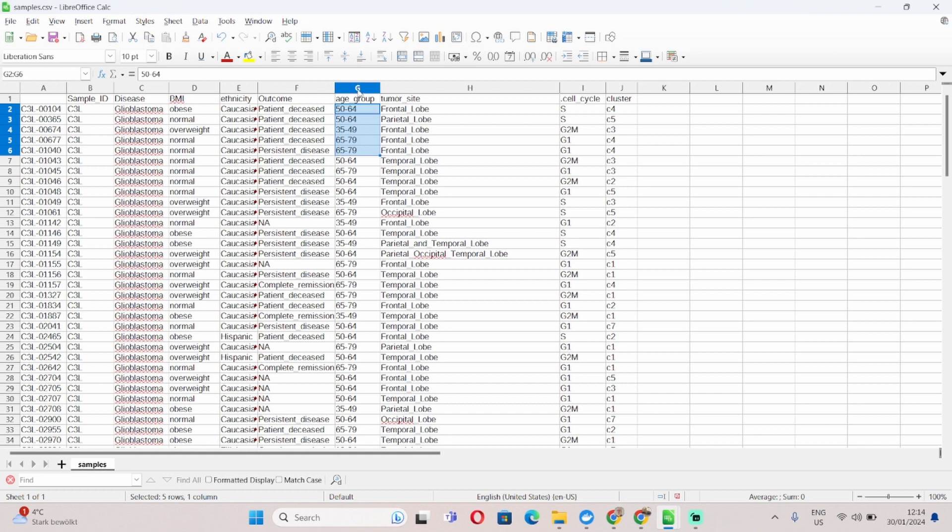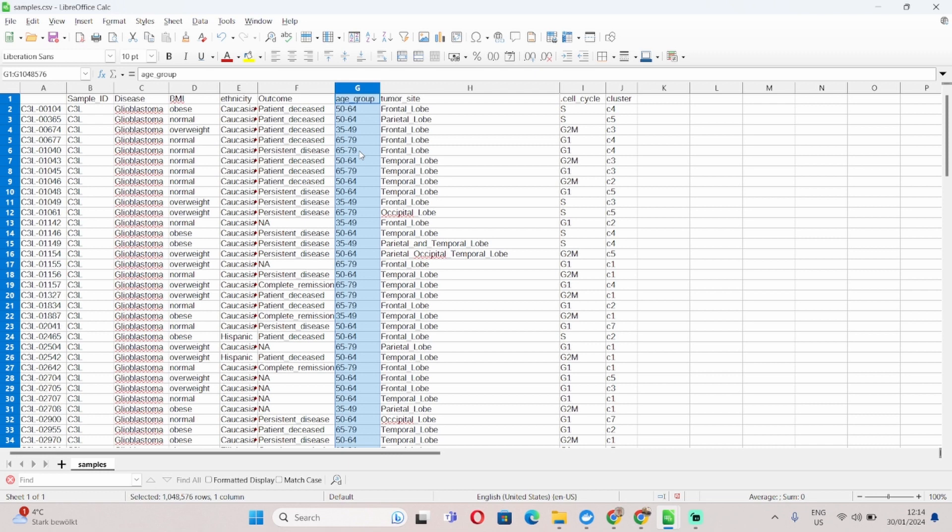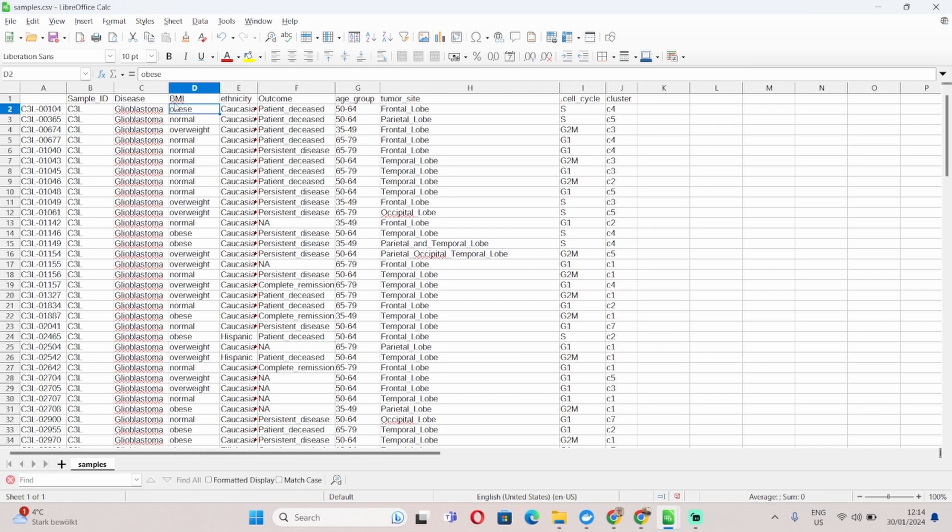So remember, whenever you have any numerical values, could be age, could be height, could be weight, or in this case also BMI, you have to convert that into a range or a category. So in this case for example I converted the BMI into categories, obese, normal, overweight, underweight, and so on, rather than using the actual value.